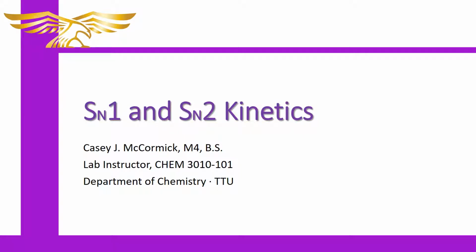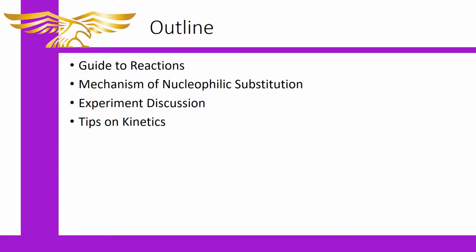Welcome to your pre-lab webinar on nucleophilic substitution reactions, and especially regarding the experiment we will do this coming Monday on SN1 and SN2 kinetics. We'll start by looking at the reactions and getting a general feel for how we develop them. We'll discuss the mechanisms of nucleophilic substitution. We'll discuss a little bit of the experiment that you'll be doing, and we'll talk about some tips on how to do proper kinetic assays.